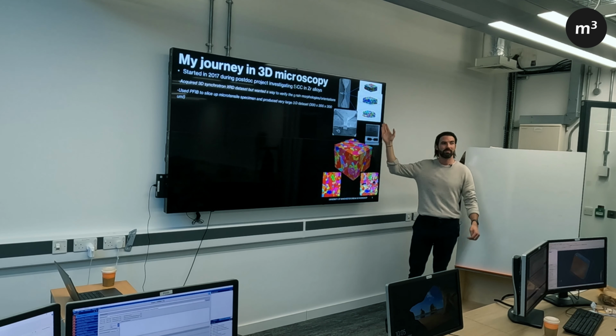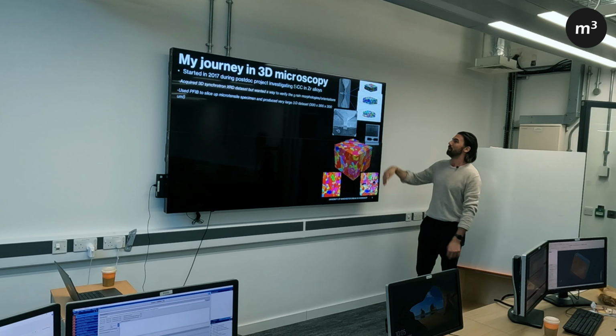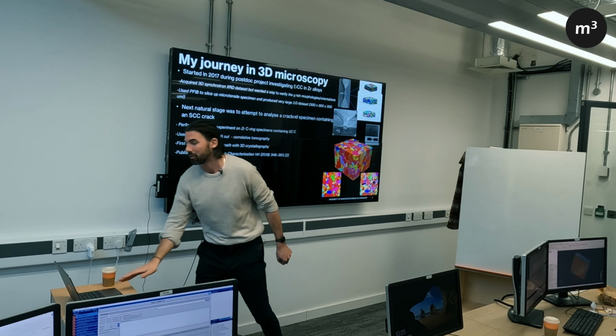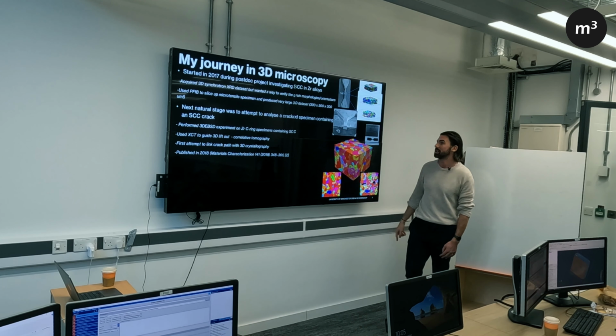So I thought from this that serial sectioning is easy, but as we'll find out later, it's all about sample prep. Anyway, we ended up slicing up this data set, and I think we made the largest ever data set with the PFIB, 300 by 300 microns, and we got a really nice data set, and then we were able to correlate our DCT grain shapes using 3D EBSD.